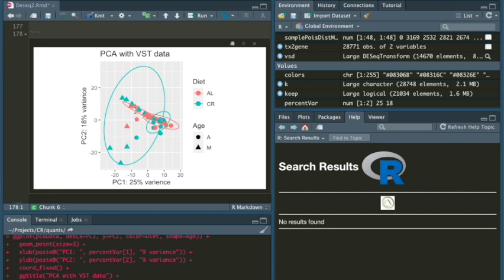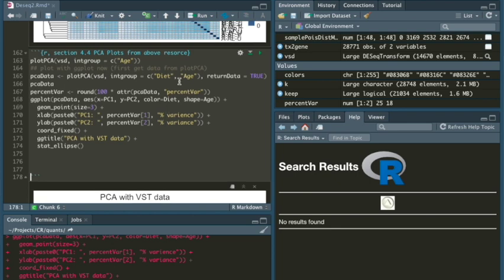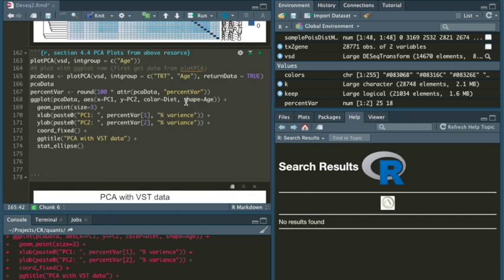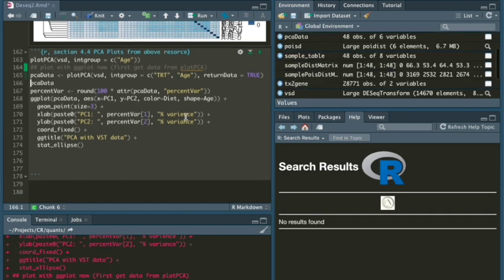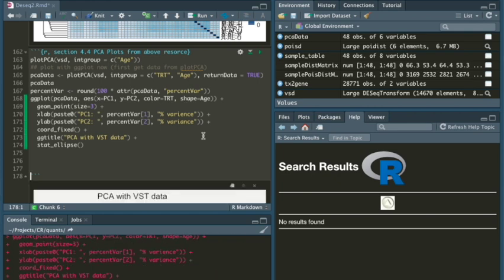The aged ad lib and the aged calorie-restricted tend to look like they're within each other. So it doesn't look like much of a difference, as well as the mature ad lib and the mature calorie-restricted. They are both circles within each other. I don't see much distinction between any of these, honestly. Maybe between the mature ad lib, which is this red one, and the aged calorie-restricted. That might be a difference, but I'm not sure. So we can play around with this a little more. Let's change it to age and treatment.